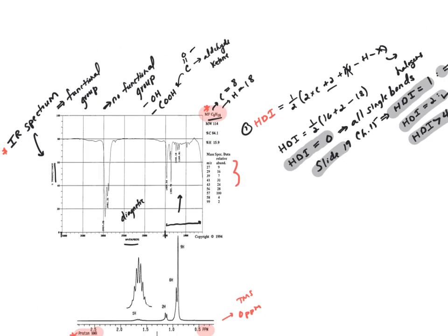So we would expect to find this in the double bond region. What's really important about this one is that it gives a very, very intense signal, meaning a very deep trough. Not super broad, but very intense. Again, I go over reasons why you see that in the lecture, so be aware of that. Other things are going to be the carbon-carbon double bond. This is not as deep. This is not as intense as the carbon-oxygen double bond. And again, there are reasons behind that that have to do with that bond.